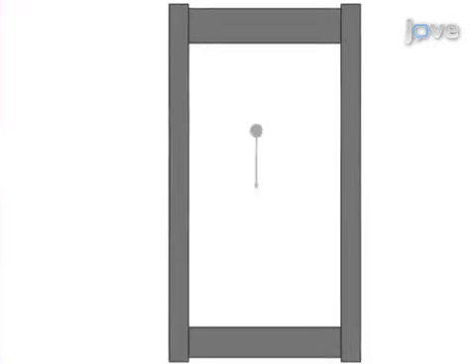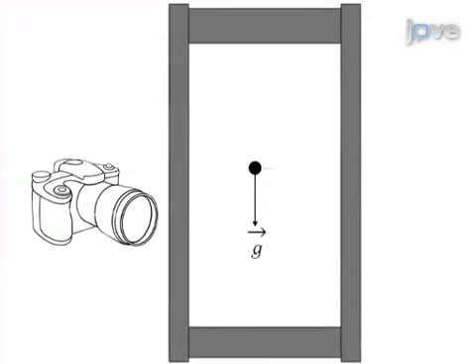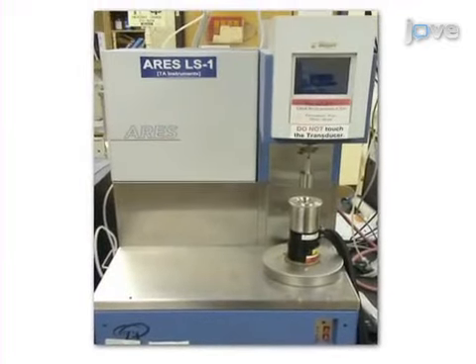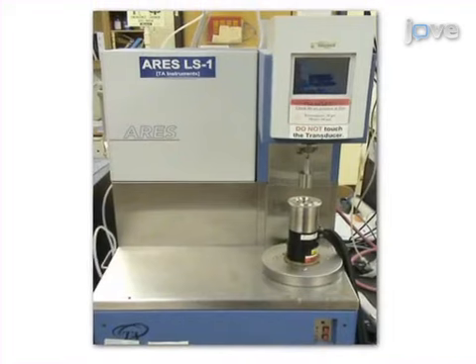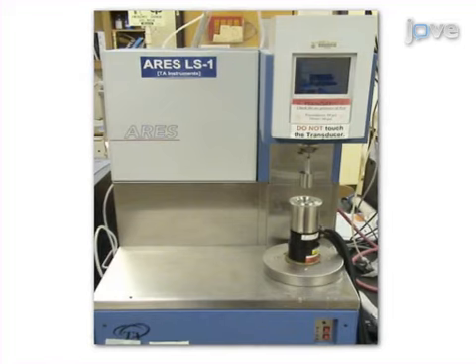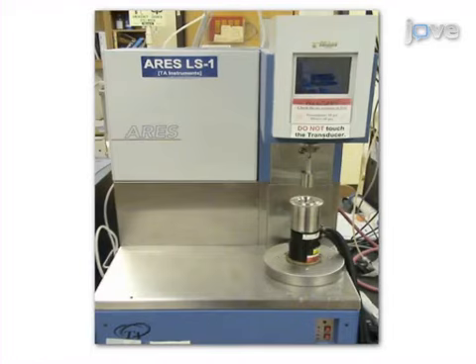Next, the settling velocity of the particles is measured in the presence of parallel walls in a parallel plate experimental cell made of plexiglass. The final step is to measure the rheological properties of the fluids using a rheometer. The properties are correlated with the settling velocities of particles. Ultimately, the experiment helps in measuring the settling velocities in unbounded and bounded viscoelastic surfactant fluids as a function of their rheological properties. The data can be the basis for quantifying the influence of fluid elasticity on settling velocities.